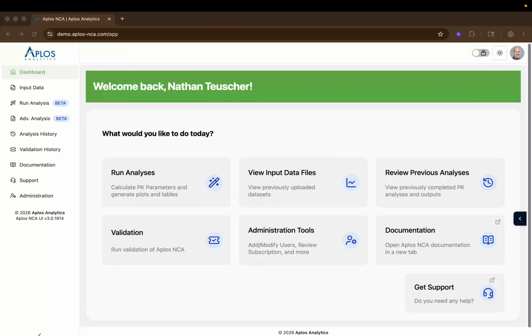This will be available for all current subscription holders, as well as anyone that signs up new to use this application. So this is an overview video. It's meant to give you a few little details. We'll have specific details on all of the different integrated pieces separately.